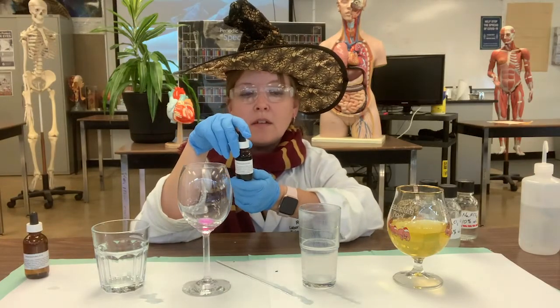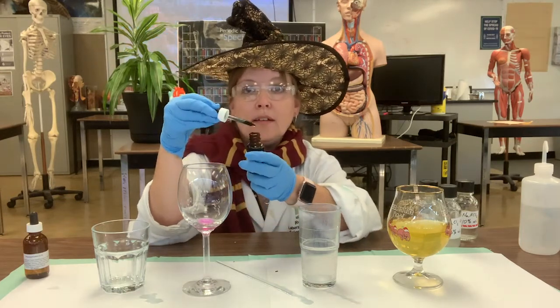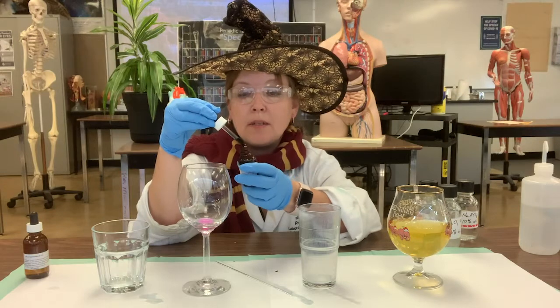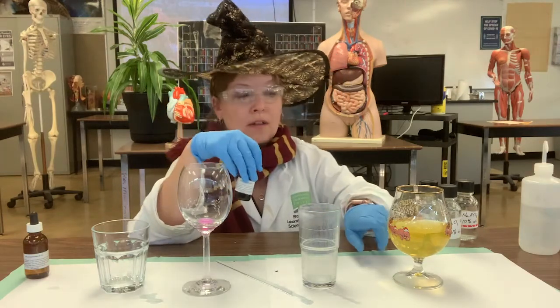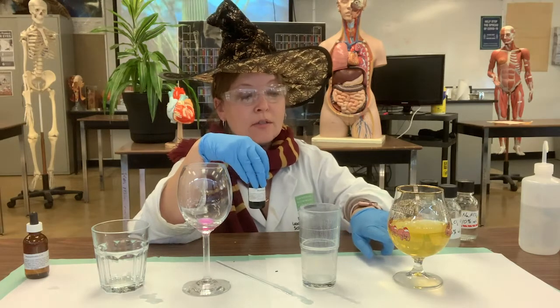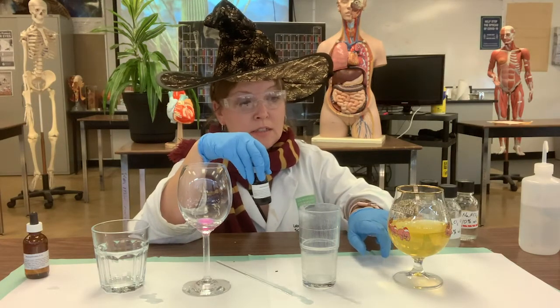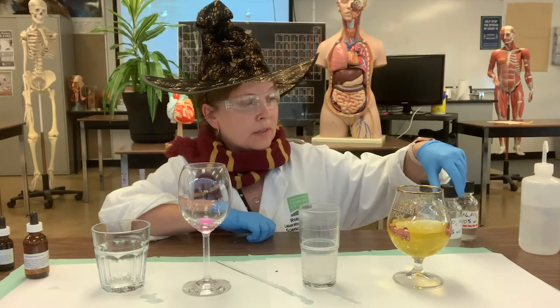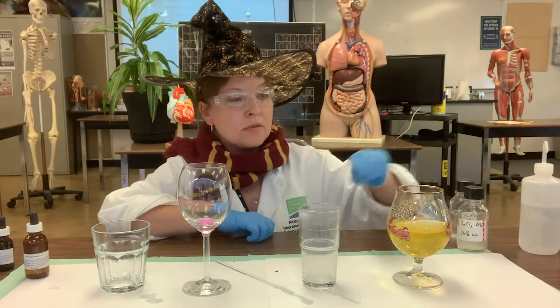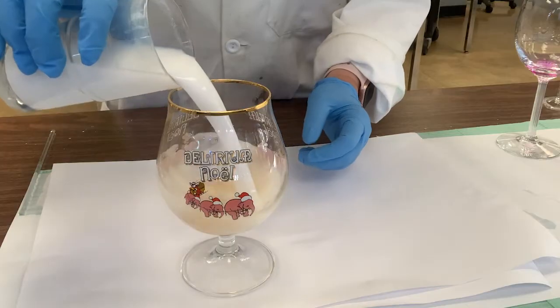Bromthymol blue is used to indicate acid or base — it appears more blue in basic conditions, and turns yellow when it goes acidic. We had some high-strength hydrochloric acid in the glass, which turned the solution yellow. The acid also dissolved the barium carbonate and released CO2, which is what produced the bubbles you saw.